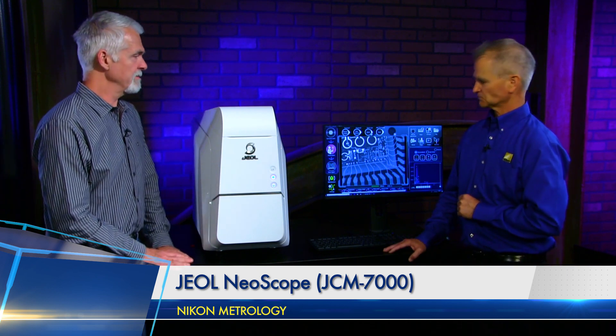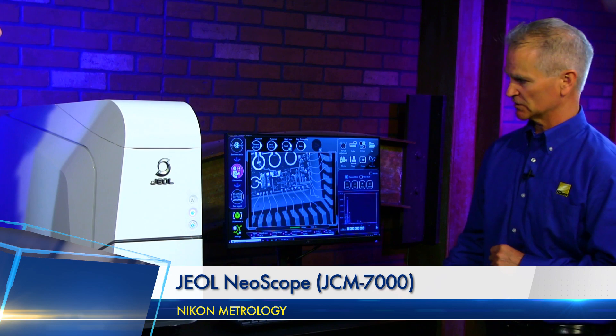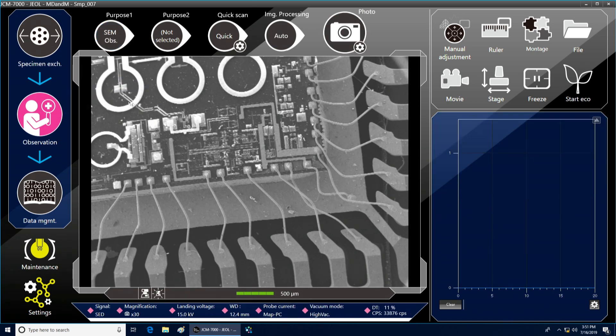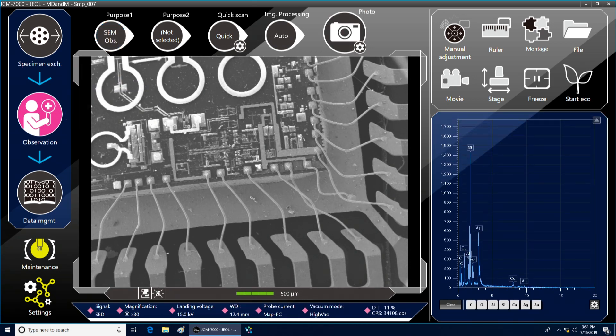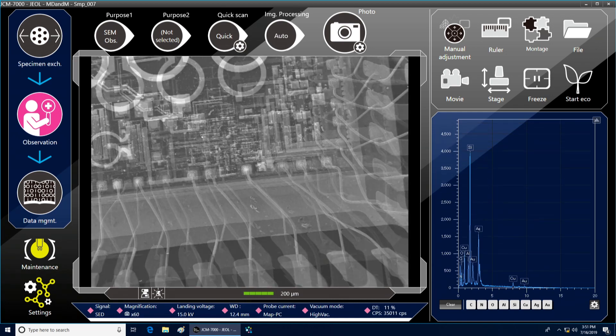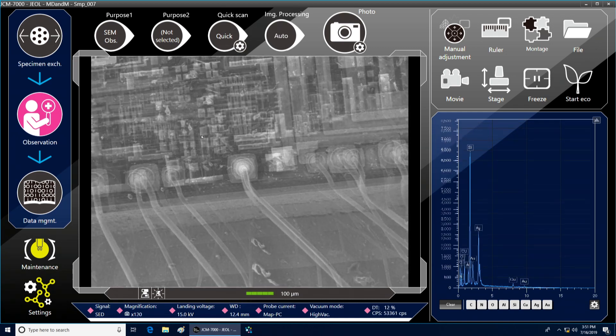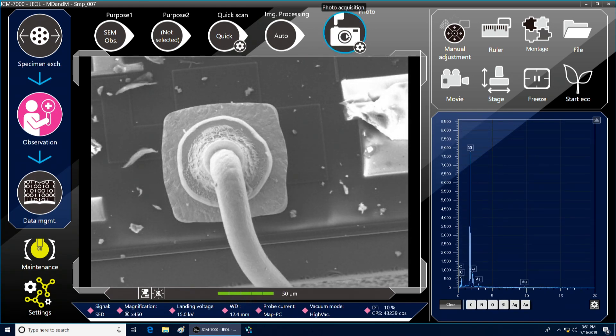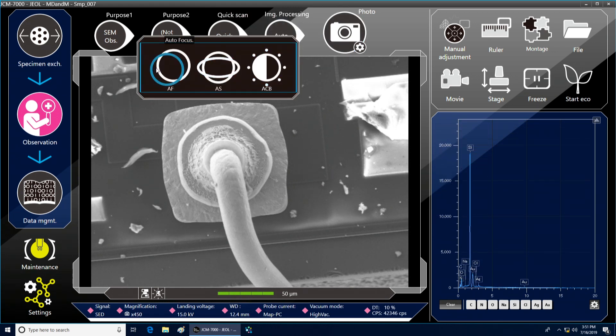Take us through the steps. The operator interface is pretty simple. We can either do just a secondary observation, or we can do map analysis or elemental analysis. We're just in secondary right now. I can zoom my image by scrolling the mouse. If I get the sample where I like it, I can take a picture. Or if I need to, I can do a right mouse click and do sample autofocus, autostigmation, or auto contrast and brightness to get the image the way I like it.